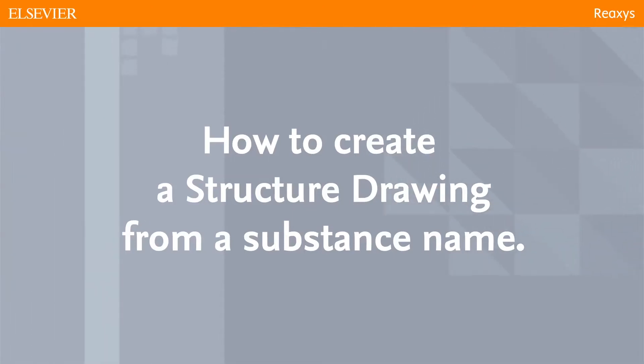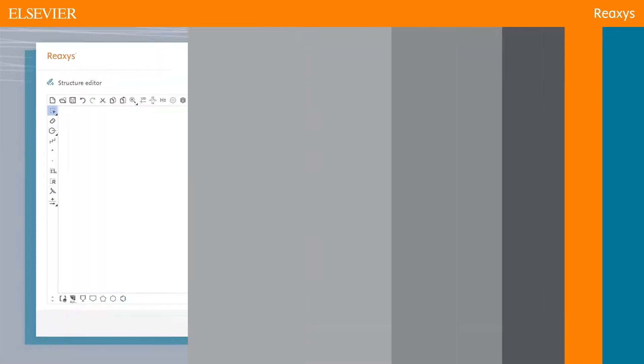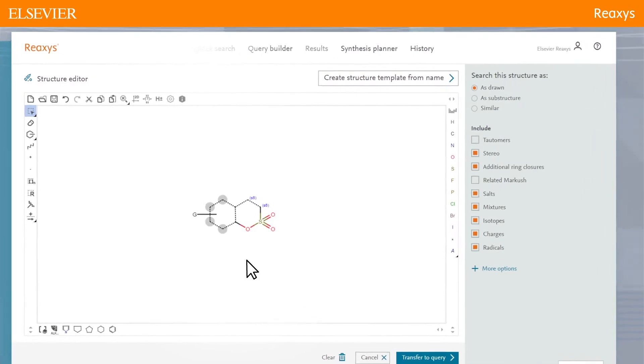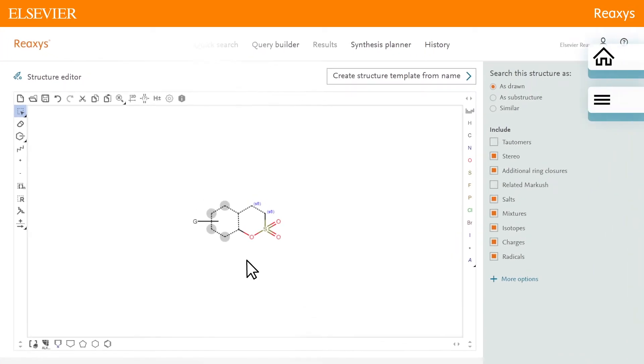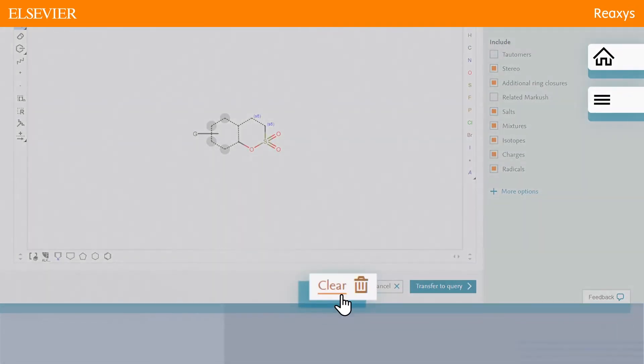How to create a structure drawing from a substance name. If you already have a drawing on the MarvinJS canvas, click Clear.